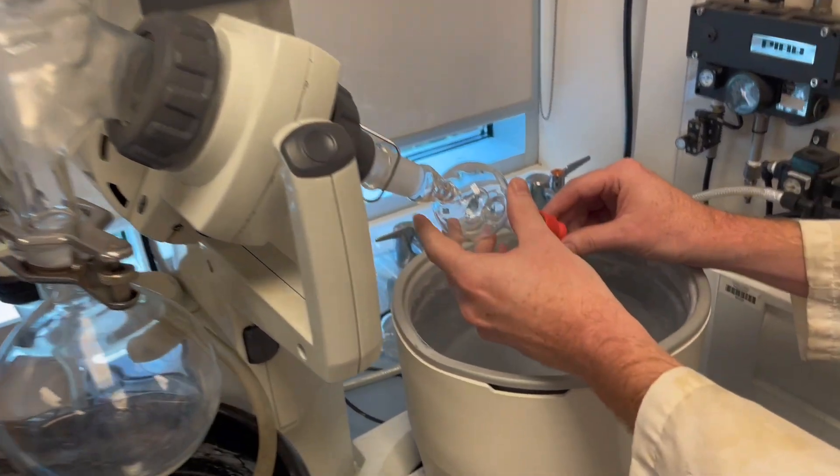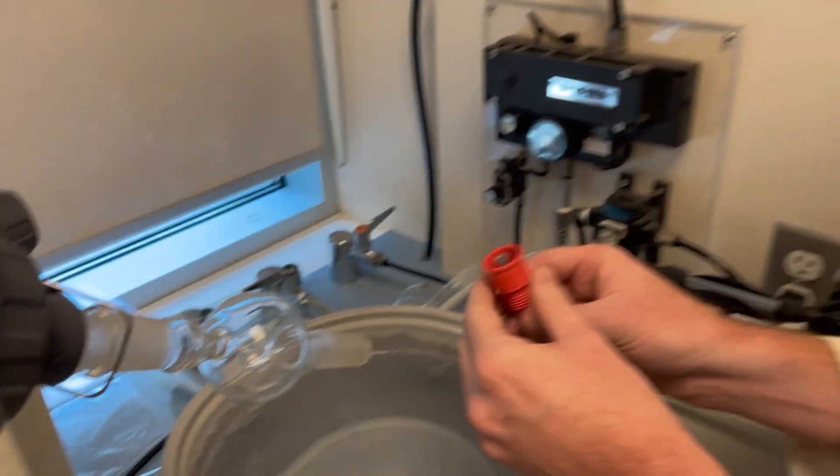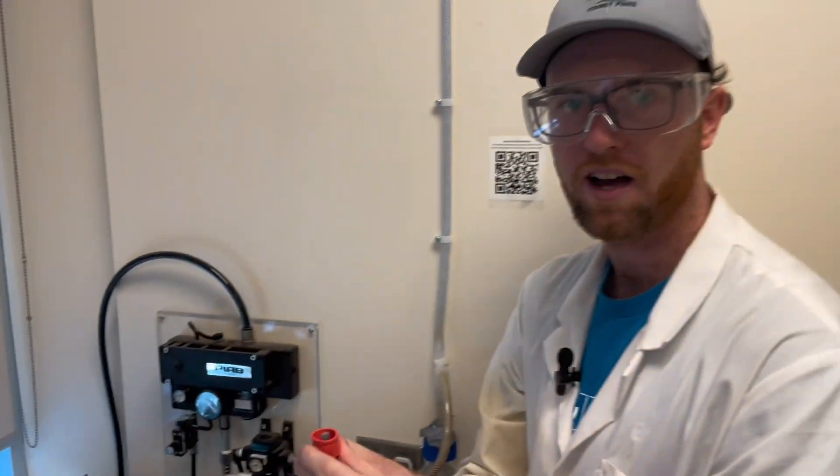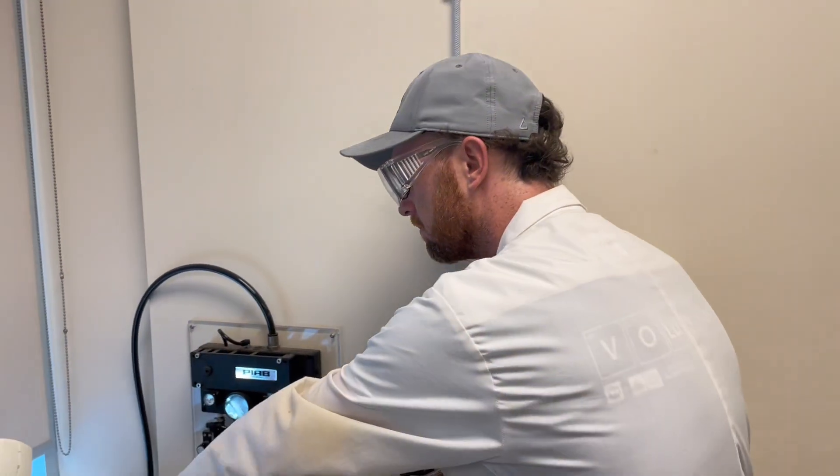And once the vacuum is out of the system, this can be disassembled, and the septa with the blunt tip vials can be reused. And that's all there is to it.